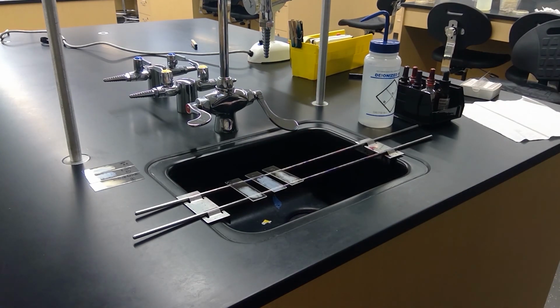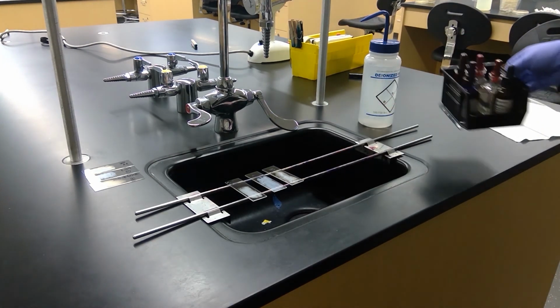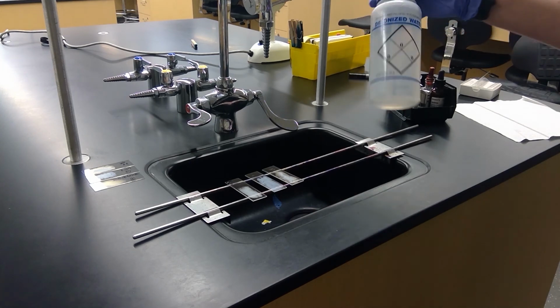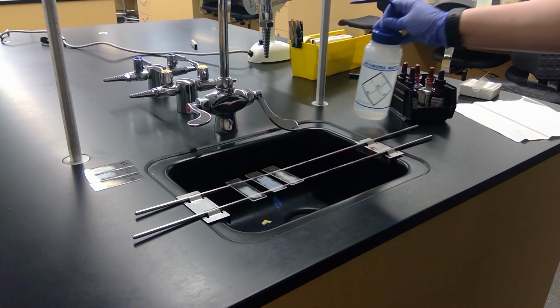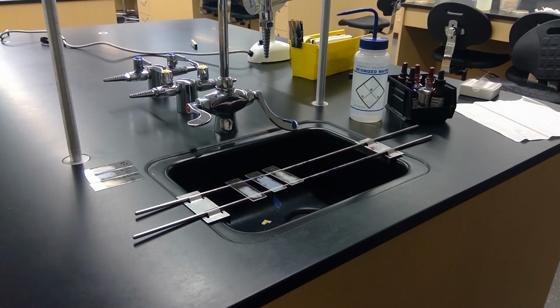Step 1, read this procedure thoroughly and then gather all required materials. So these are all of the gram staining reagents. And then I have a squeeze bottle of DI water to rinse between reagents. 2, put on gloves and protective goggles.